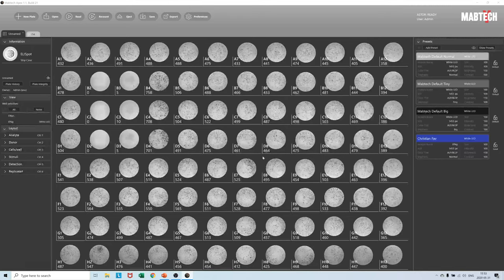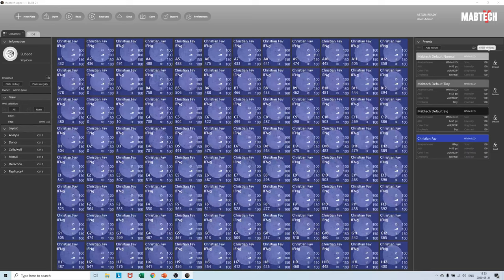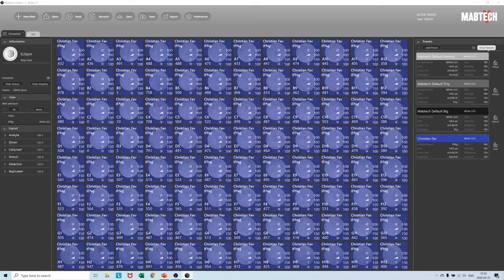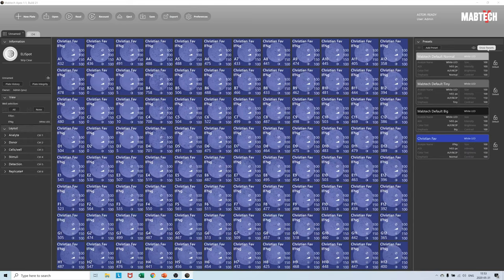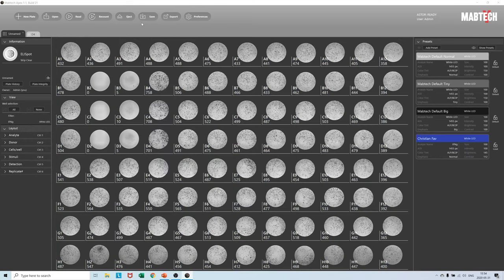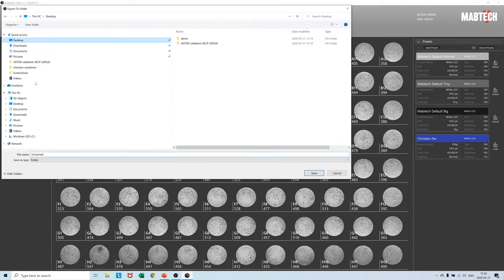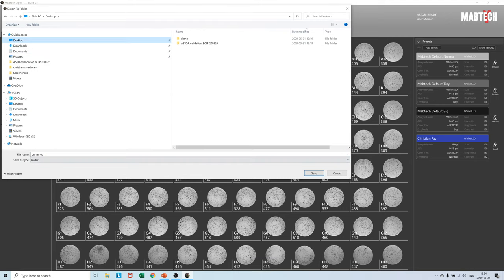You can then later confirm that the new preset is actually applied to these particular wells by again pressing the show preset button. After this short explanation of the preset system let us together save our plate on the desktop as Elispot P1 and go through the overall structure of the generated plate folder.